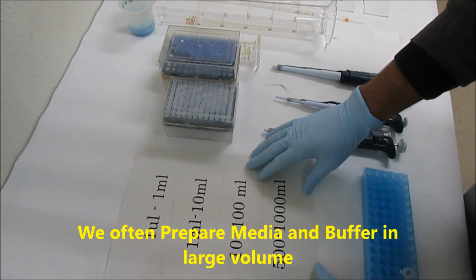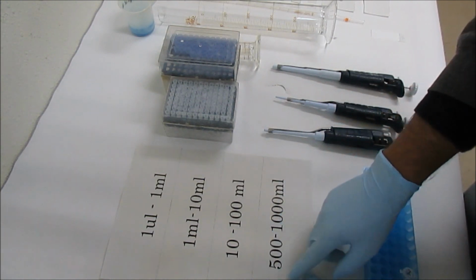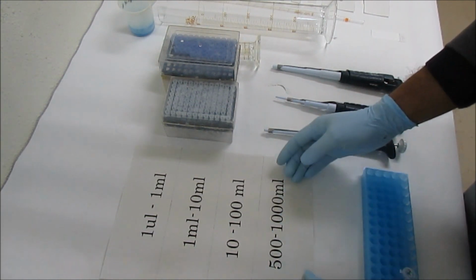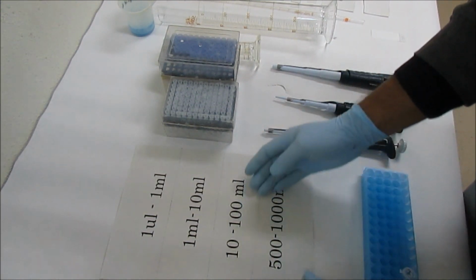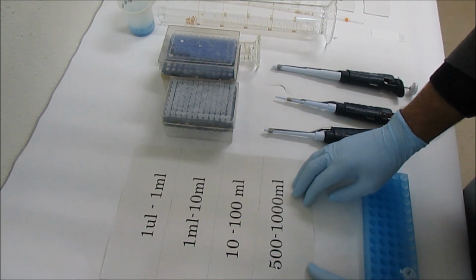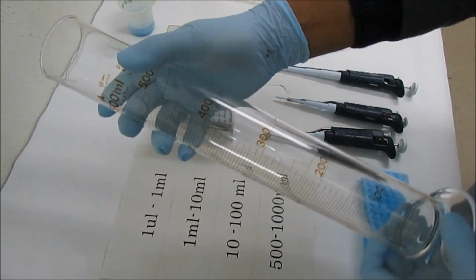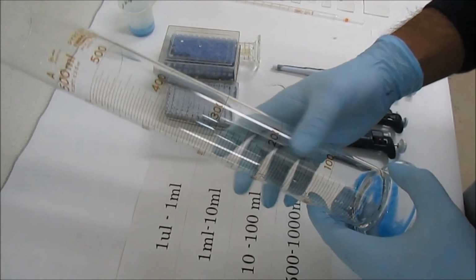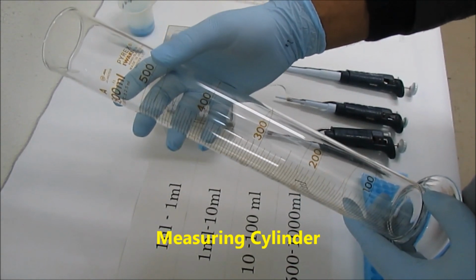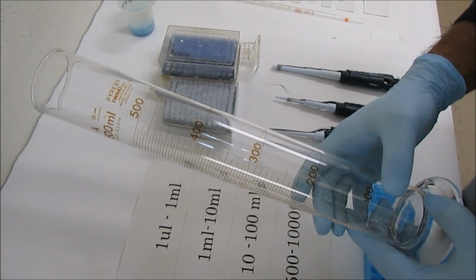Generally you prepare media and buffer in large volumes, from, let's say, about 500 to 1000 ml, or from 10 to 100 ml. So exactly how do you measure these liquids? I'm going to show you this measuring cylinder. Particularly you measure the volume of liquids on a large scale with it.